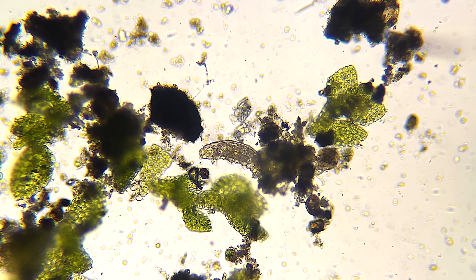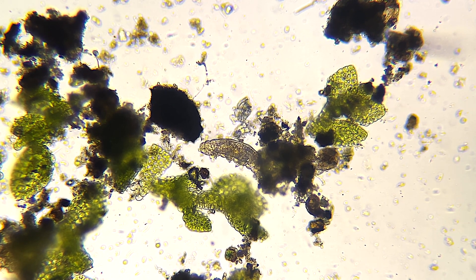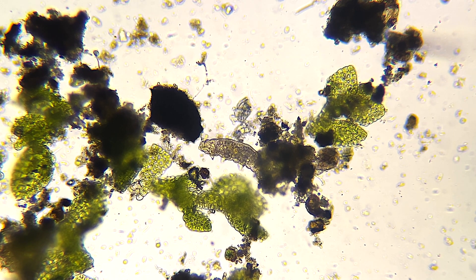He was completely frozen lengthwise like that, and now it looks like he is starting to do what water bears do.